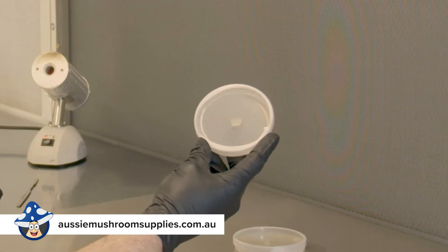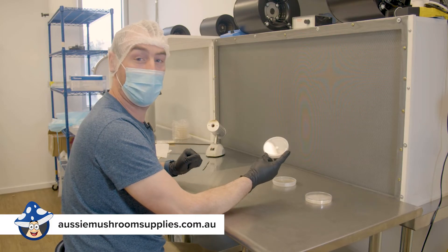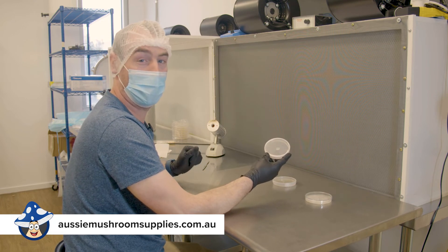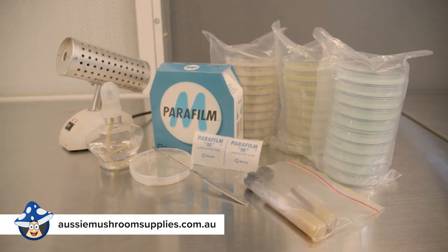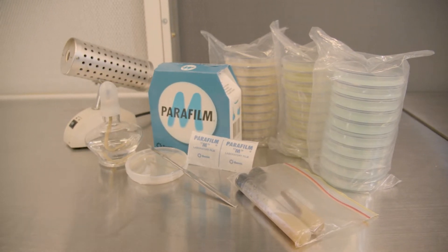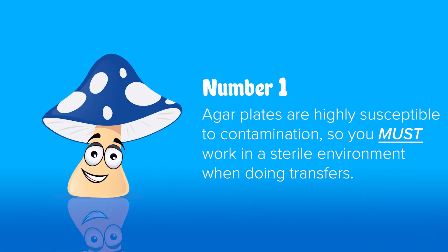Over the next week this transfer should grow out from the center to the outside. When it's about 80 percent grown, you want to put it in the fridge to stop it growing. Make sure every month or two you do new transfers to just keep your cultures young and fresh, and keep an eye on them that they're growing properly and have no troubles.